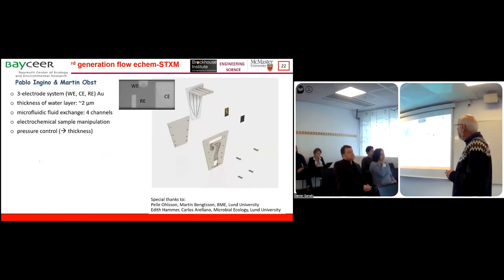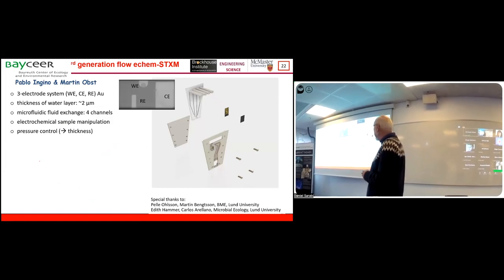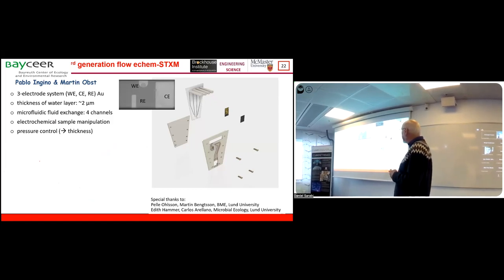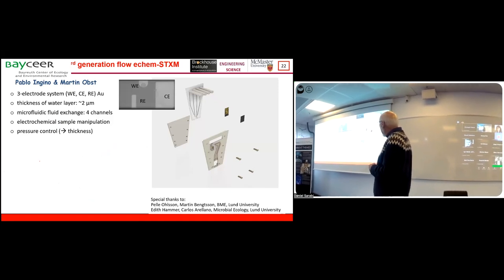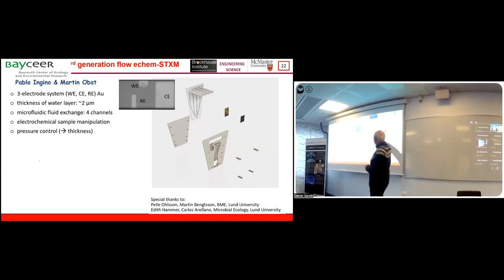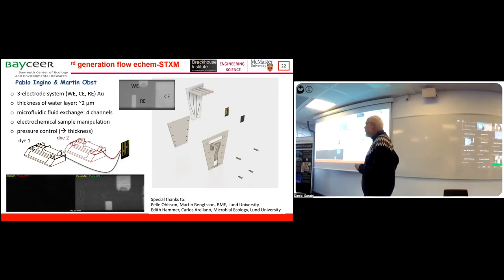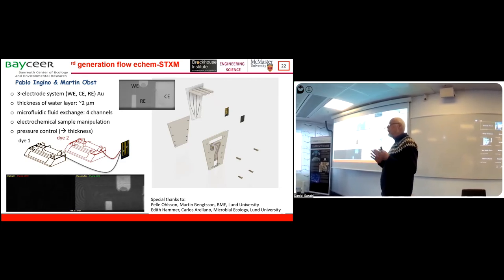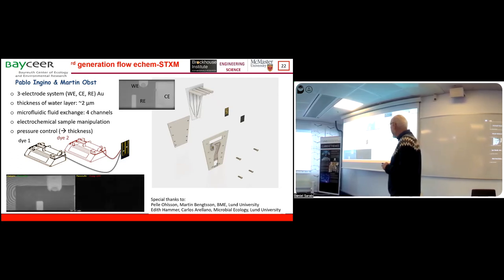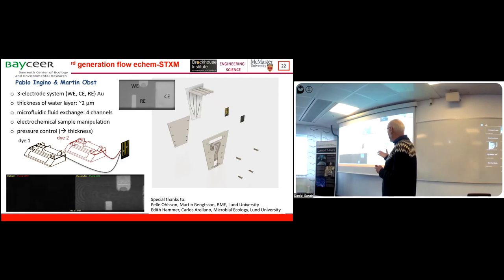So, what's special about this device? There are commercial devices that are designed to fit into soft X-ray systems. They can't work below 500 eV. This system works right down to 200 eV. It's a classic electrochemical system with a working, counter and a reference electrode. And it's basically a microfluidic device in the sense that there are glass-PDMS composite channels. And the beauty of this four channel, two in, two out approach is that we can change the electrolyte very quickly. This is in most systems very tough because you're going down very thin tubes into an even thinner layer. The fluid layers we want are 2 microns thick, and you've got to go over a couple hundred microns. And so this is a demo of the speed of changing two different optical dyes.